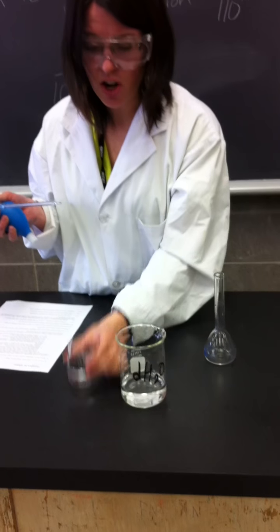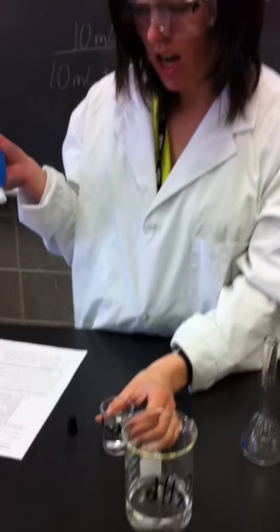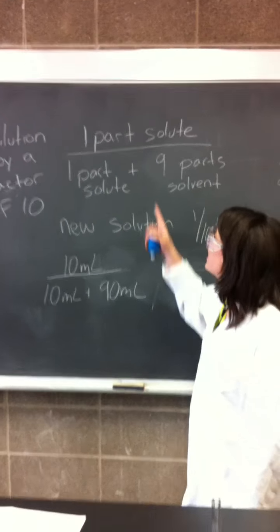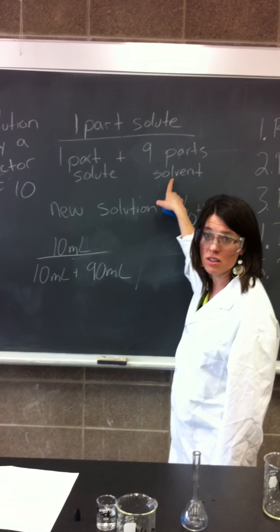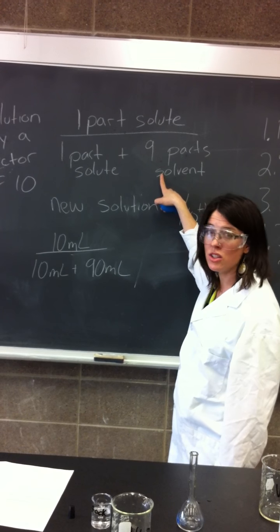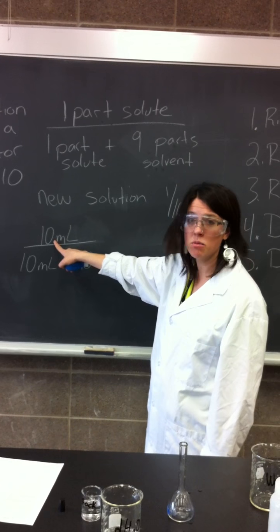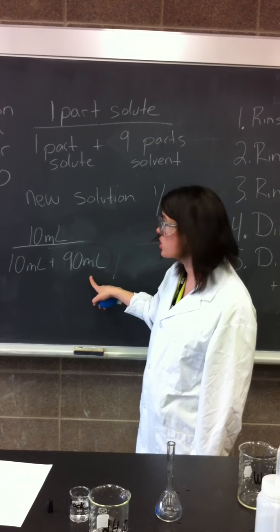All right, so if we're going to dilute an acid, this is our stock solution that we've got from our strong acid over here. And we're going to dilute it 10 times. So if you can imagine, when you do a dilution by a factor of 10, it's 1 part solute to 9 parts solvent. So whatever numbers you're working with, it could be 1 mil, 9 mils, it could be 10 mils, 90 mils. But in this case, we're going to take 10 mils of stock, and we're going to add 90 mils of solvent, which of course is water.